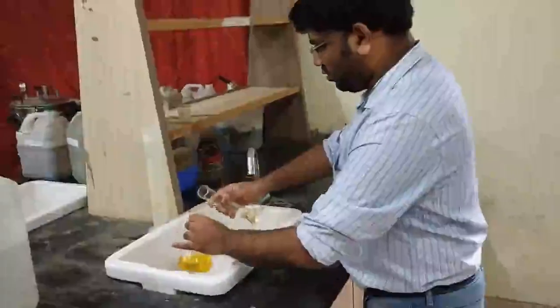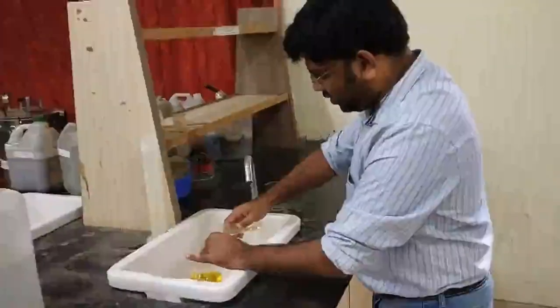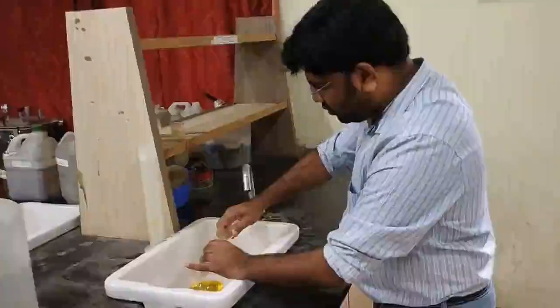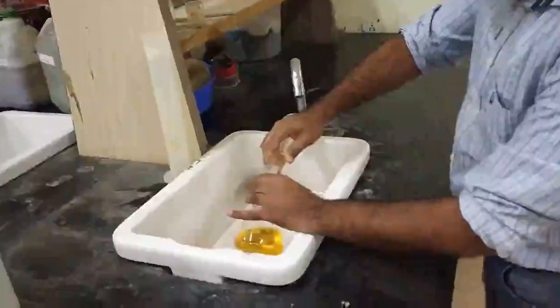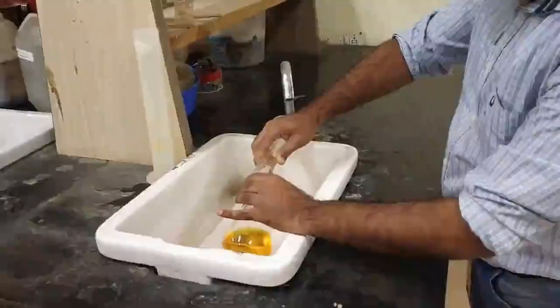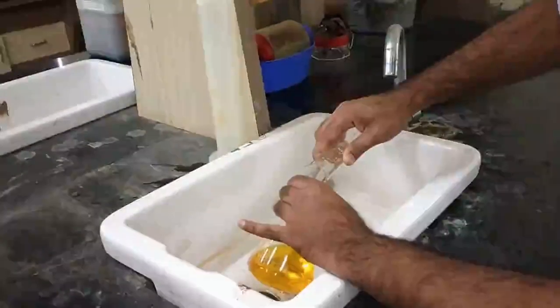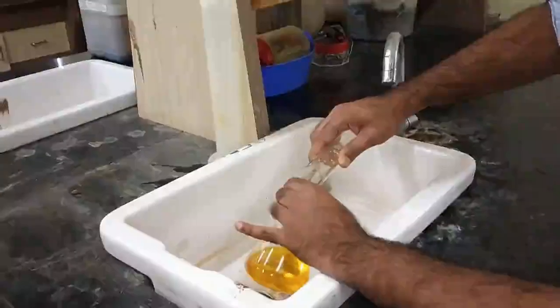While adding it, you have to tilt the flask slightly. You have to hold it in this position, and you have to add H2SO4 slowly and continuously. I guess you can hear a sound when this H2SO4 is reacting with the liquid below.